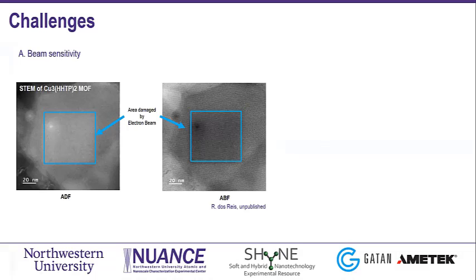So some of you may be thinking now, there are a lot of developments in cryo-EM, right? So that led to a Nobel Prize a few years ago. But how about if you want to do something more localized, or even take advantage of the multimodality of STEM, right? So collecting not only your image, but your chemical information, perhaps taking spectroscopic images such as using EDS, right?